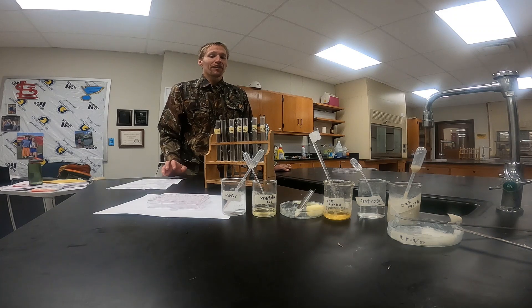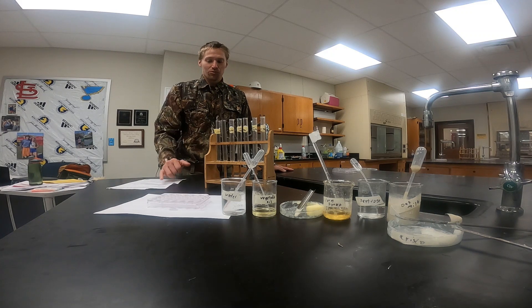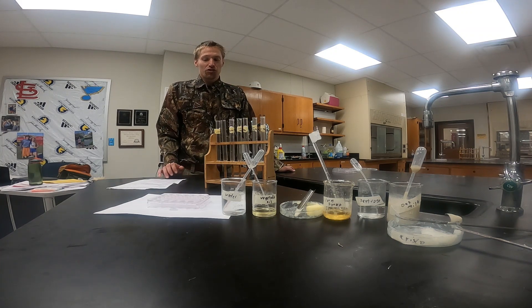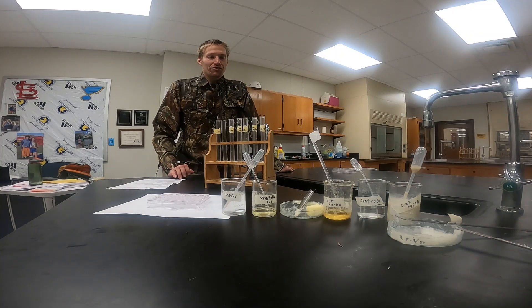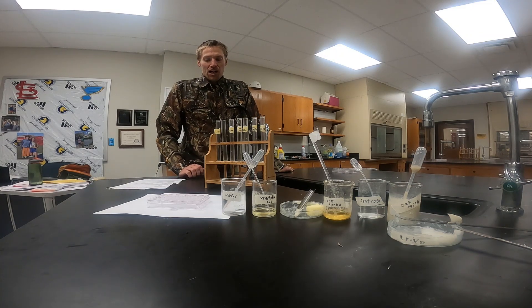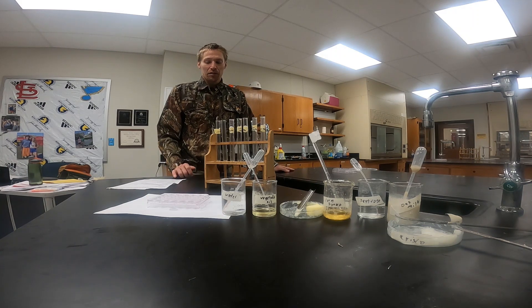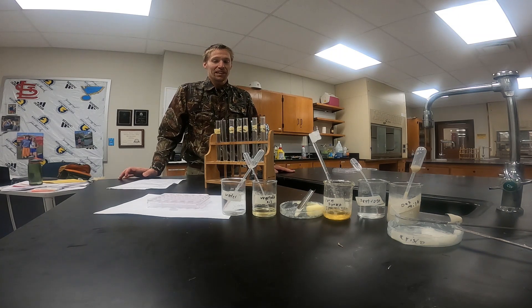We're going to do a total of five different tests: Benedict's solution test to test for the presence of simple sugars, iodine test to check for the presence of starch or polysaccharides, biuret solution test to test for the presence of protein, and then two lipid tests — a Sudan IV test and a brown paper towel or brown paper bag test.